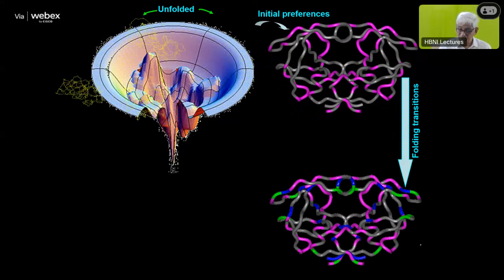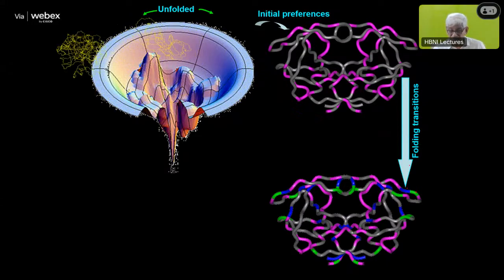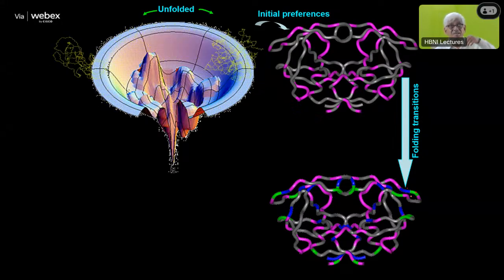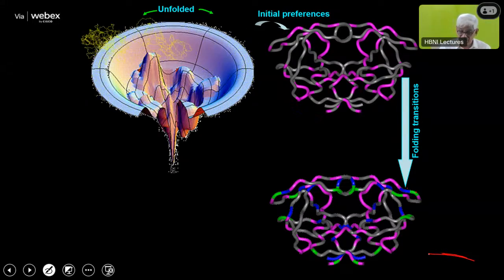And as the folding transitions happen, you see that this area gets folded. After that, this gets folded. And you see all of these stepwise folding events are very adjacent to the previously folded residues. What it means is a particular folded residue induces a conformational change in the neighboring residues. So kind of a cooperativity. All of this is shown on the folded structure, but what we are observing will be on the unfolded state. But the neighboring residues are affected, indicating there is a kind of cooperativity in the folding pathway.